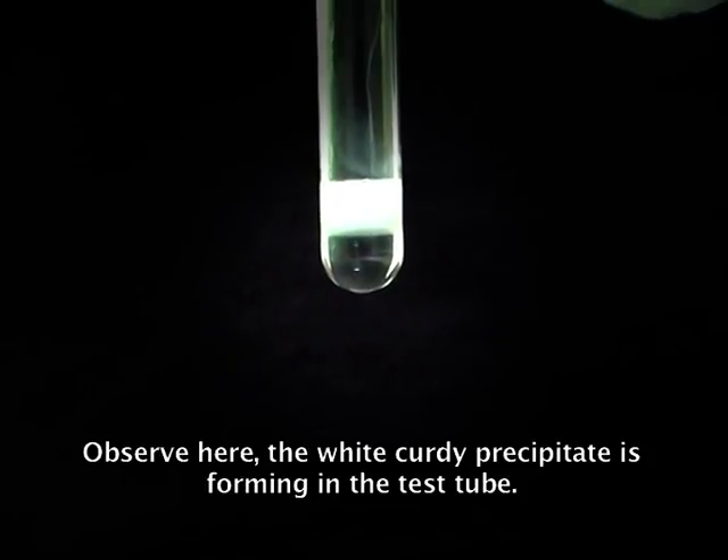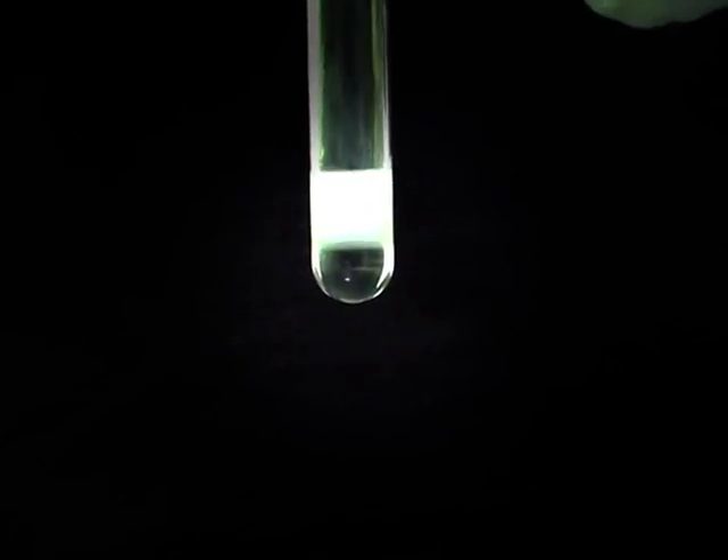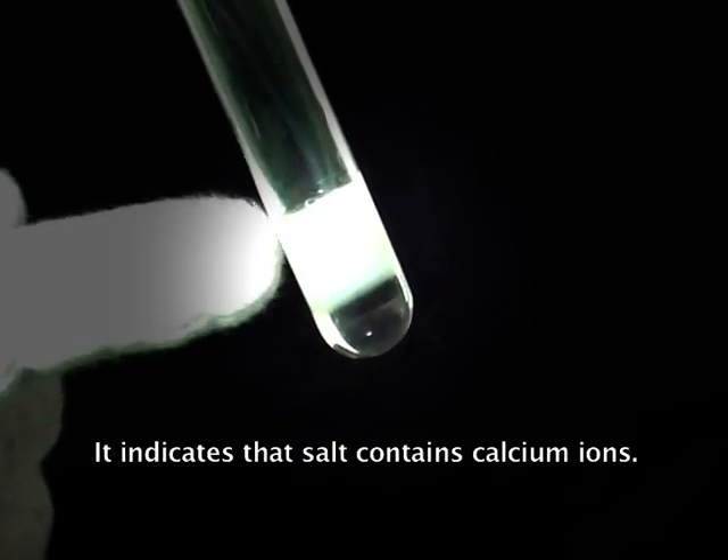Observe here — a white color precipitate is forming in the test tube. It indicates that the salt contains calcium ions.